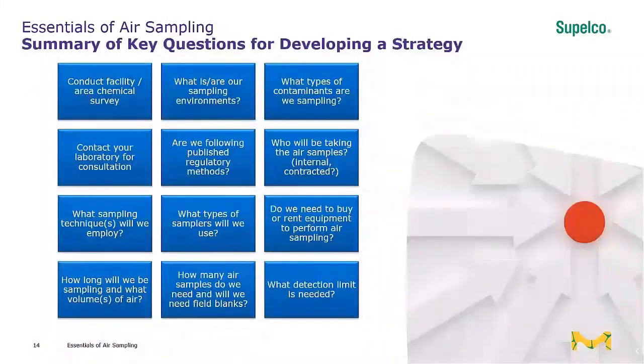So in developing a strategy, these are some key questions to ask yourself and keep in mind as you are trying to pinpoint the source, and if you know the source, some questions to ask when you are determining what type of sampling device to choose.